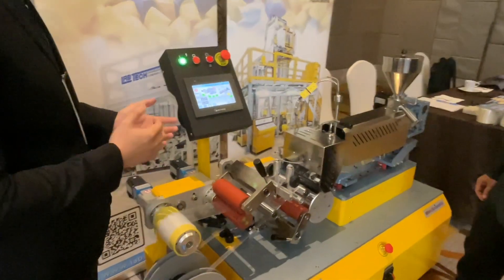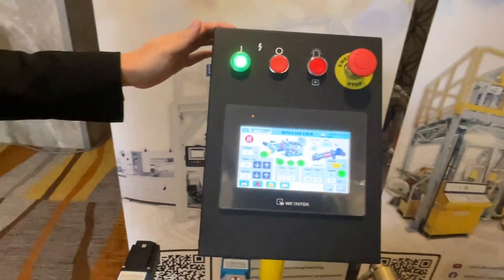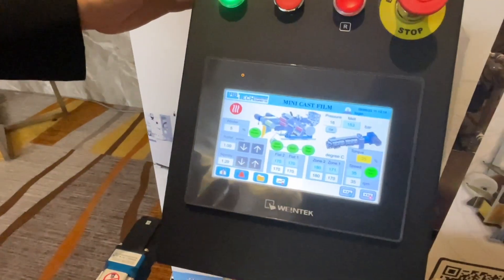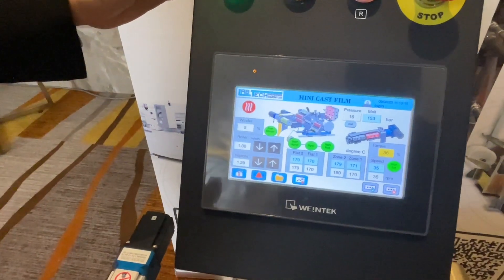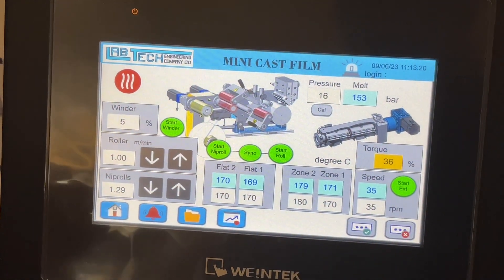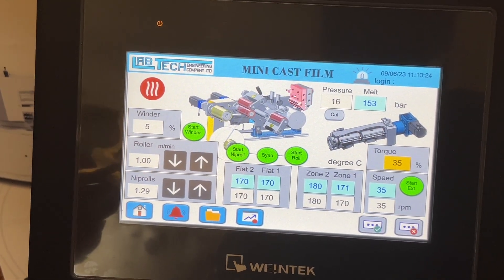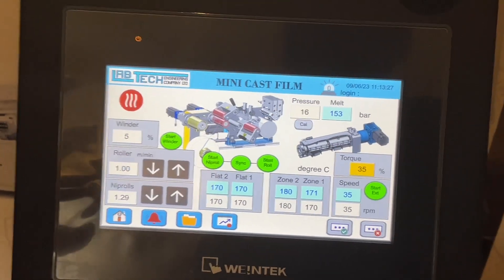The whole machine is controlled by using the computer right control system. So from here, you can not only change the temperature, torque, value, pressure, and speed of the winder roller, but we also can see the alarm if the machine has a problem.